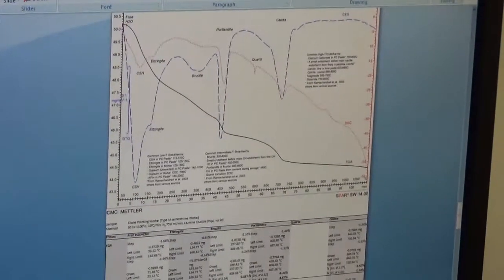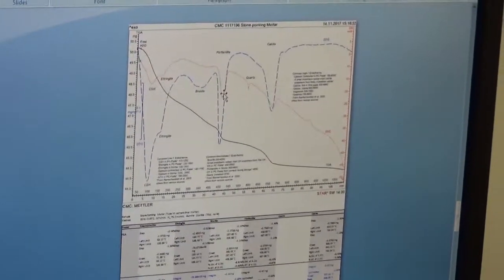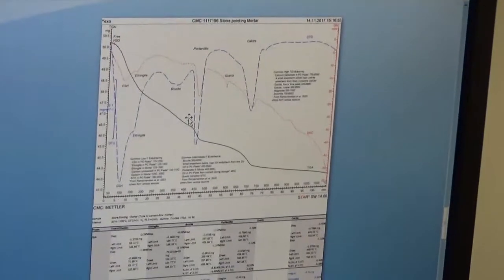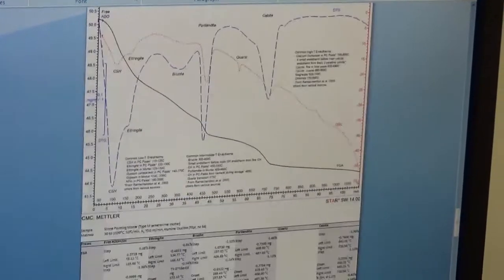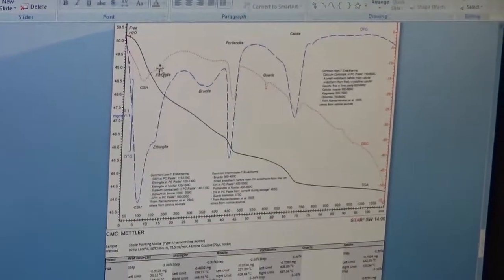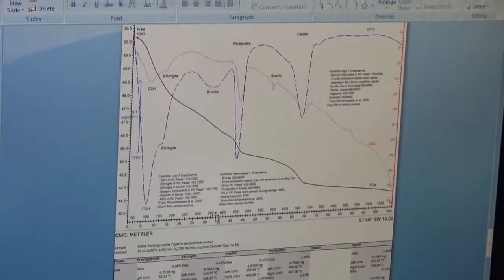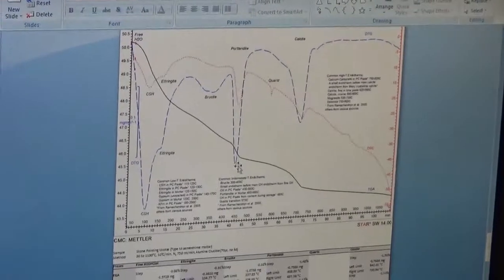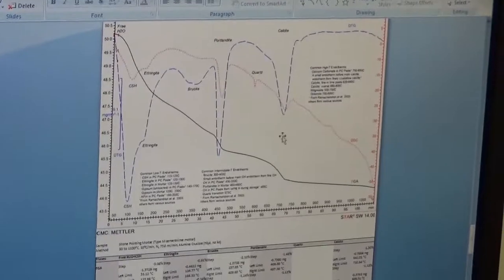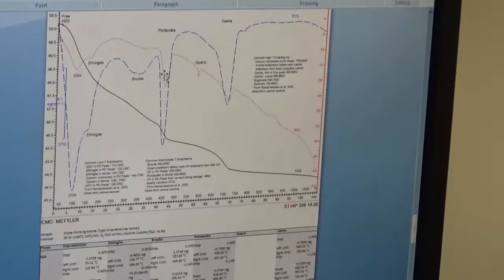This is another mortar — a pointing mortar — which was Portland cement, a little bit of dolomitic lime, and coarse sand, similar to a Type M Portland cement dolomitic lime mortar. You can see calcium silicate hydrate and ettringite show up from cement paste dehydration — very characteristic. Then brucite from dolomitic lime gives this dehydroxylation around 350 degrees. Then Portlandite — a very clear peak from Portland cement paste. Quartz sand shows this kink in the DSC scan, and the calcite comes from carbonated lime matrix and carbonated cement paste.